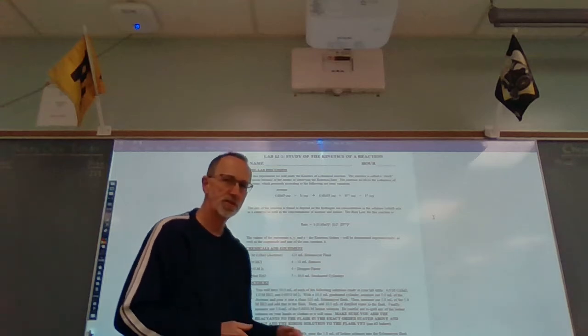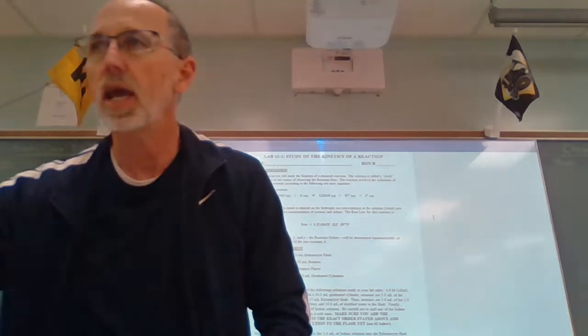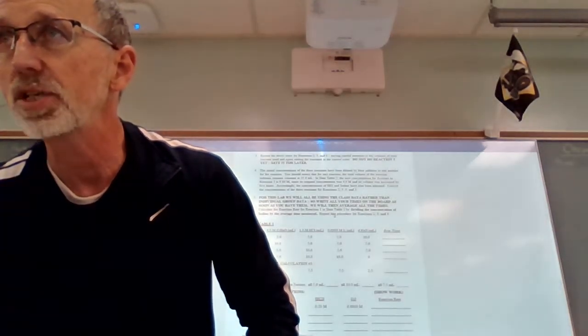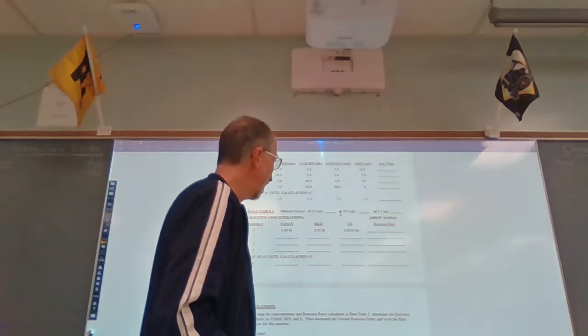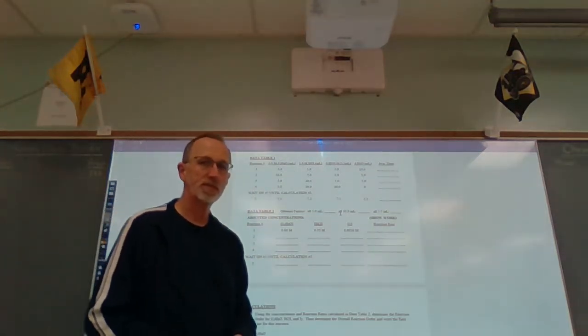So the procedure is here. We're going to come back to that in a few minutes. I want to go ahead and advance this up to the data table page. Okay. So this will give you a general idea of what we're doing today. We're going to run 5 separate experiments.